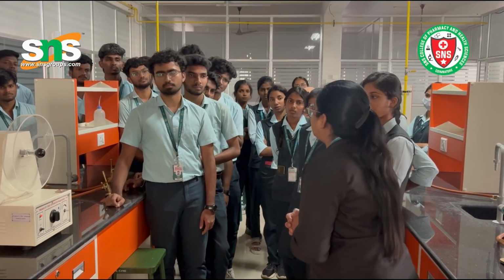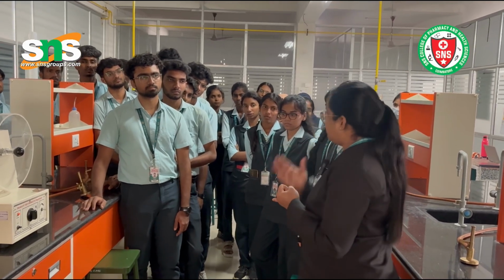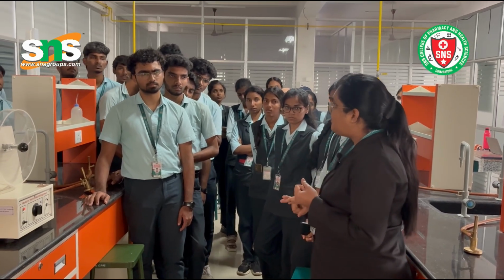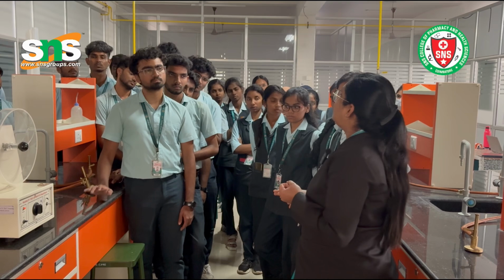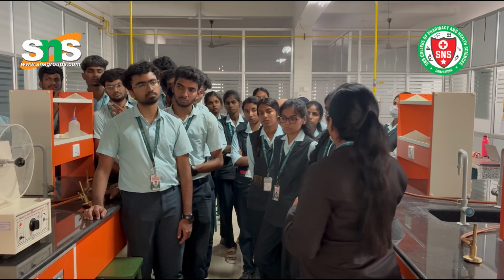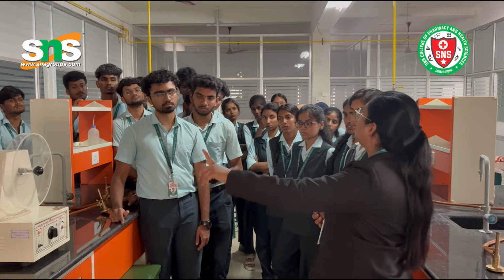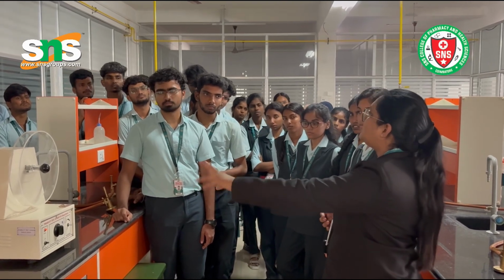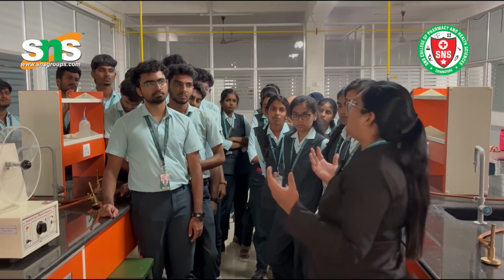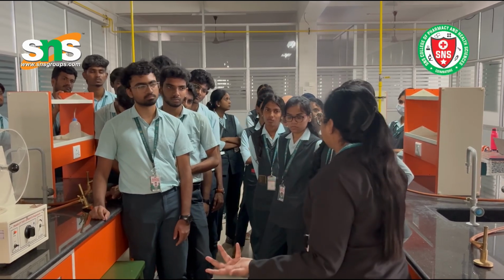Now coming to the ideate. What is the idea we are giving? We are just putting a brush for cleaning and a sensor for detection of the drum speed and also for the detection of the revolutions per minute. Exactly. Now coming to the prototype. What are the prototypes we are putting here? Sensor. What is the next one? Brush, and also a sensor for detection of speed and a sensor for detection of the revolutions per minute. Now finally, what are the results we will get? We get beautiful, accurate results.